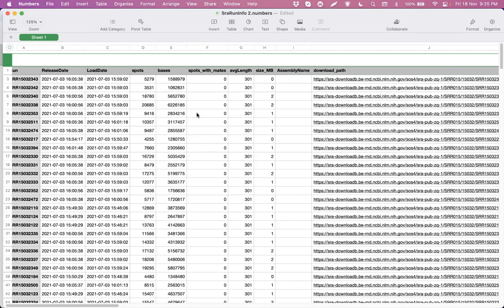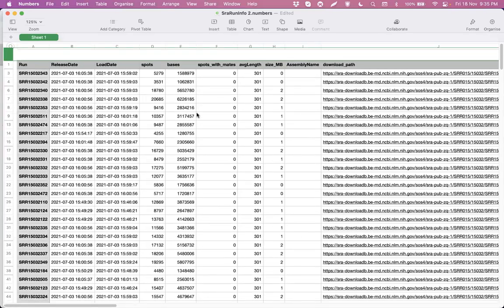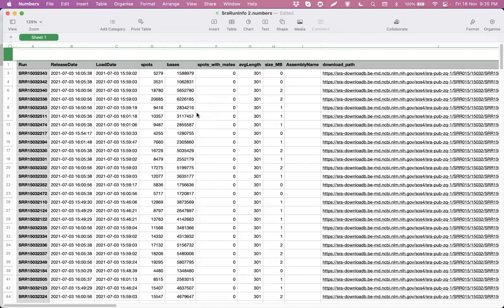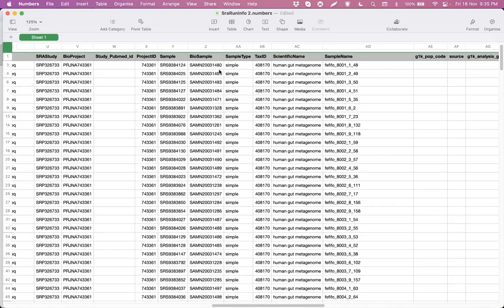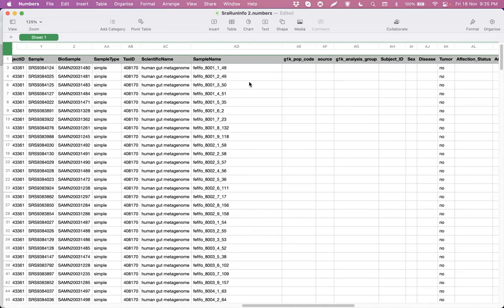Because when we are going to set up this pipeline analysis, we are going to set it up only for a handful number of samples, like 10 or 12 at the maximum, not more than that, right? And for that, you can easily click on each one of them and then identify the read length from the NCBI page themselves. So this gives this information. How do I know that this is after 1, 2, 3, 4, 5, 6, 7, 9? That information is actually given in the method section of the paper. So if you go and read the method section of the paper, it's actually given there. So that's how we know.